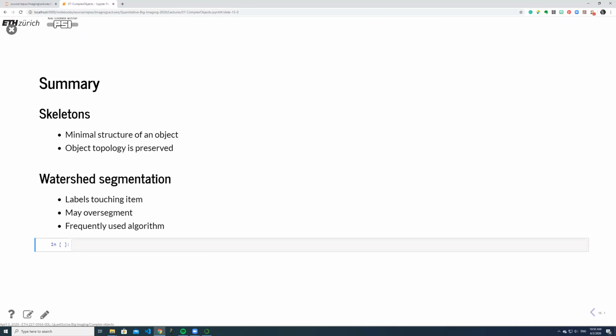One little comment here that I forgot to say, that the skeleton in 2D is reducing by 1 dimension. So we get lines between nodes. In 3D, you could actually also reduce not only to lines, but also to planes. And some algorithms not only produce the lines between the nodes, but can also produce some kind of planes that are describing the topology. For some applications, it can be useful. In other cases, you want to get rid of these planes and reduce them into single lines as well.